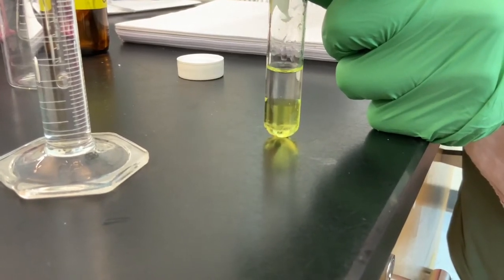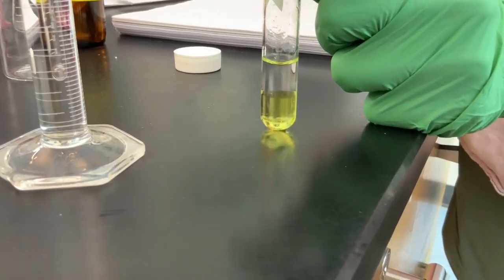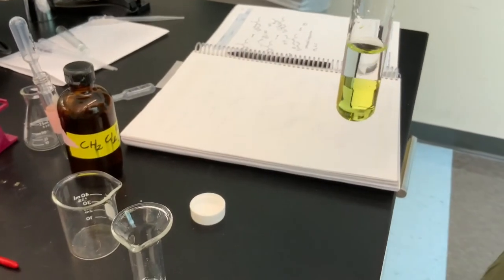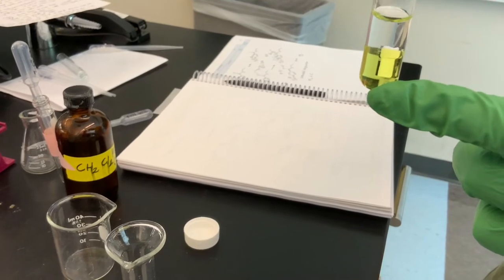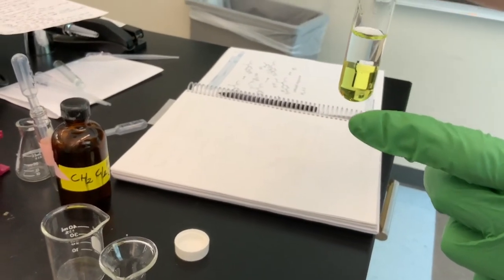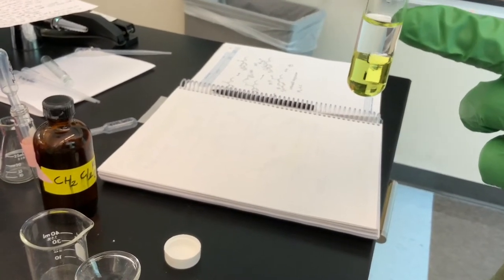So the top layer is our aqueous layer. It's the 3 molar hydrochloric acid. And the bottom layer, of course, still is our methylene chloride organic layer, right? And it's always easy to remember this is because the 9-fluorenone, which is yellow, will always remain in the organic layer because it is neutral. So it's always more soluble in the organic layer, regardless of the pH of our aqueous layer.